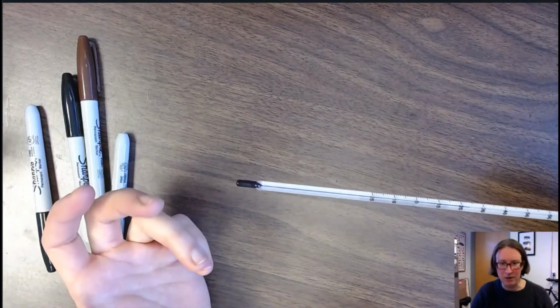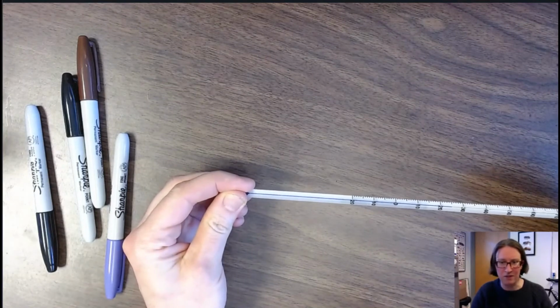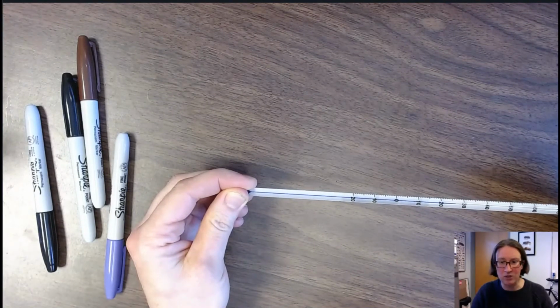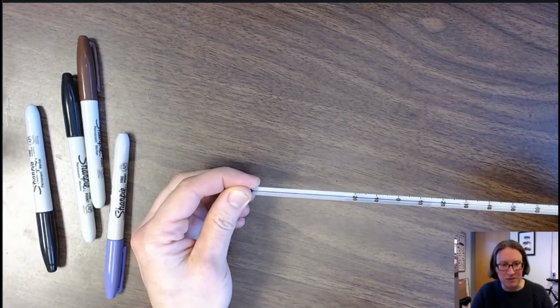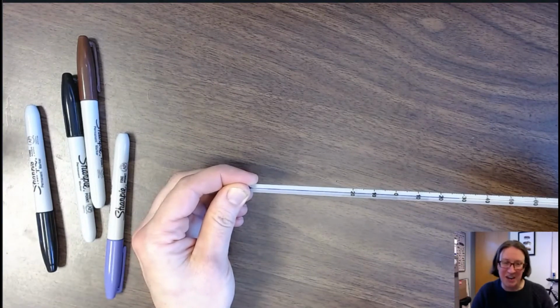This thermometer is calibrated such that when there's a change in temperature, so if I put my fingers around the end of the thermometer, there's going to be a quantifiable change in the measurement that we can read with our eyeballs, right? I hope you can see, it's a little small in the video, but you can see the, not real mercury, but the mercury starting to climb up closer to 30 degrees on this thermometer.